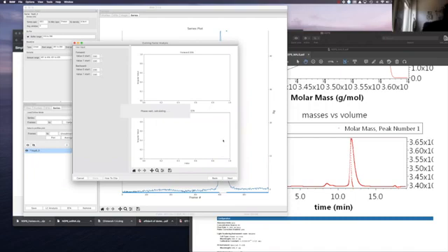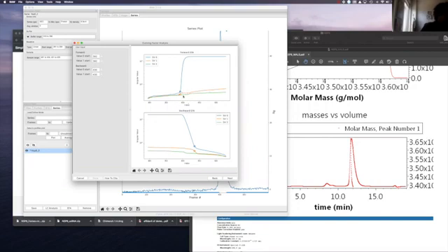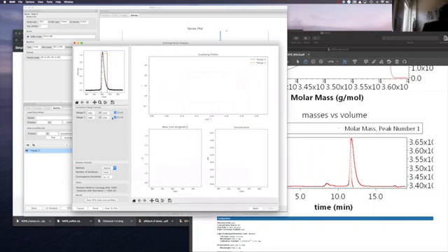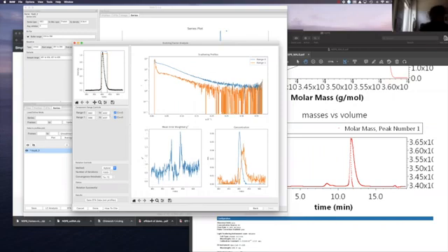If you do the very automatic next button, it shows you where the second component is barely rising from the background. When you do next, you will see that you will not be able to separate those. You can slightly adjust the region of the second peak, make it a little bit bigger. Well, it's very questionable if this is a good solution. Based on chi-square, we would kind of believe yes, but if you really want to minimize the chi-square fit of these two curves to the entire dataset, you will realize you will not be able to separate those.